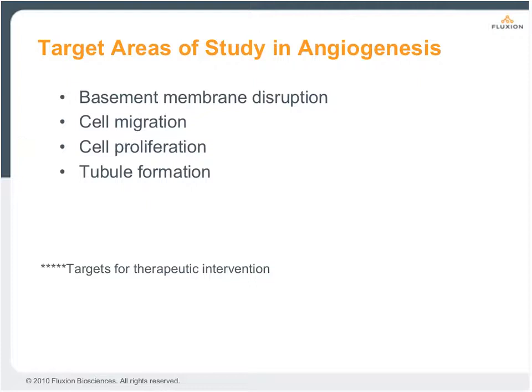Interestingly enough, many of the steps of angiogenesis, and why I really pointed them out, is many of them are actually target areas for therapeutics. And in the case, again, the first three of them can be studied in the BioFlux system.